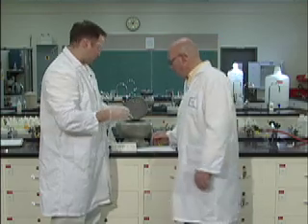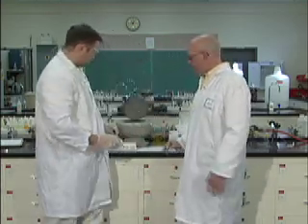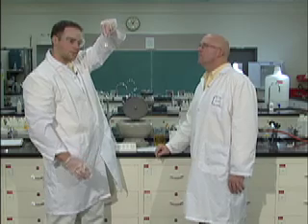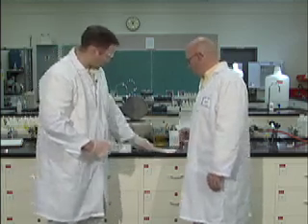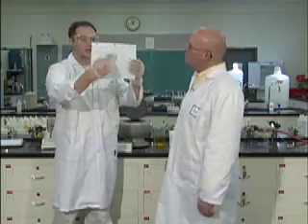So it looks like we've got a ton of test tubes. I'd be fairly organized in where you're putting your test tubes. Definitely. You need to be as organized as possible. So right now, this is my decant, what I've decanted off, and this is my solid. Now, according to our flow chart, right now, I've added hydrochloric acid.